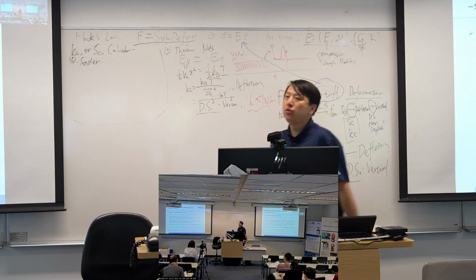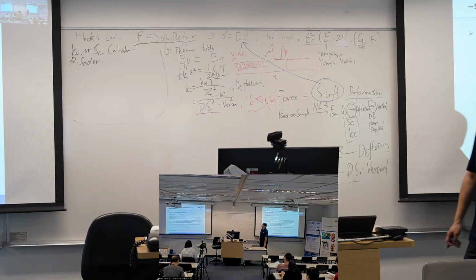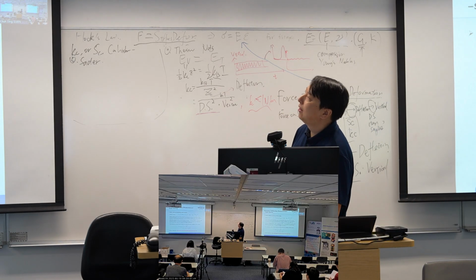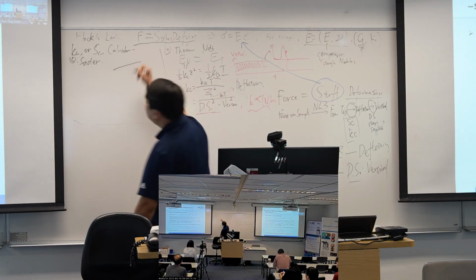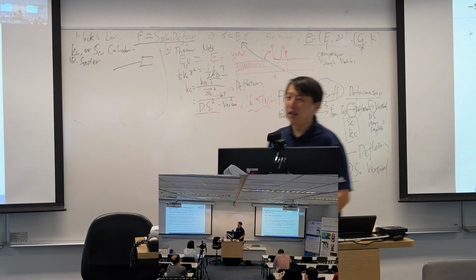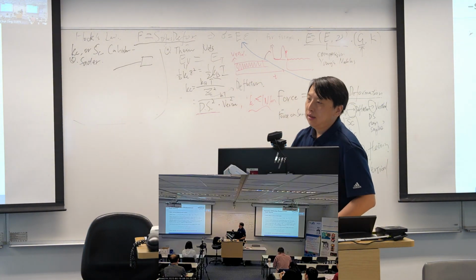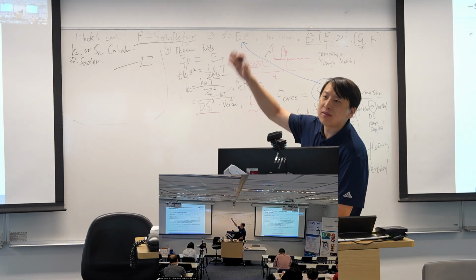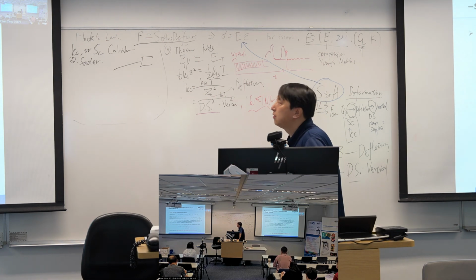He is using hydrodynamic theory to do this calibration. He considered our cantilever as a kind of beam, and this beam is beating the air inside its surroundings.